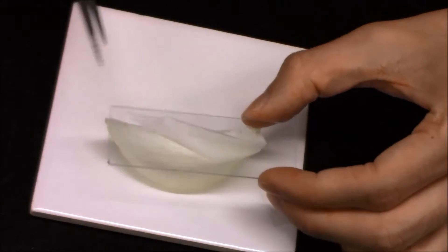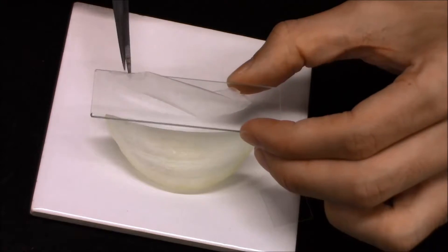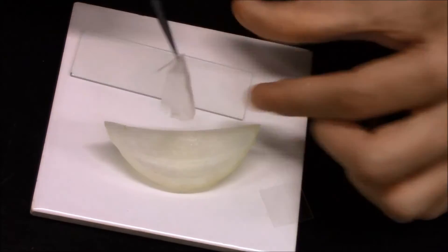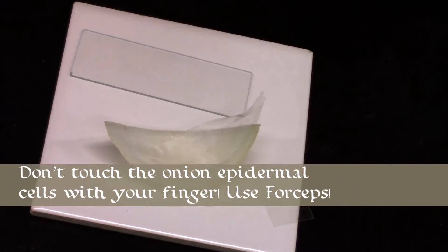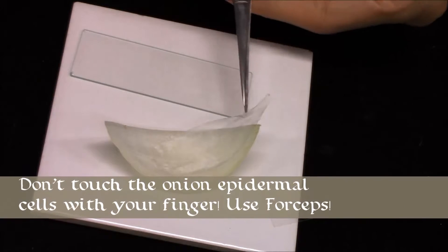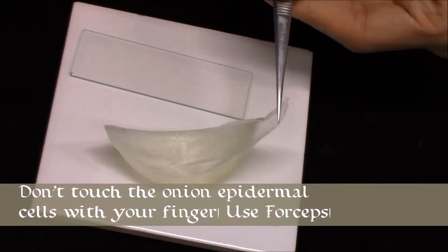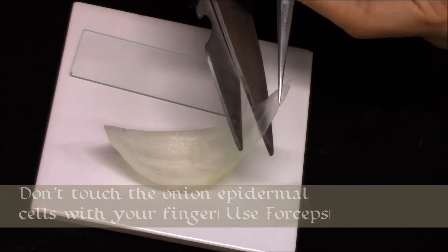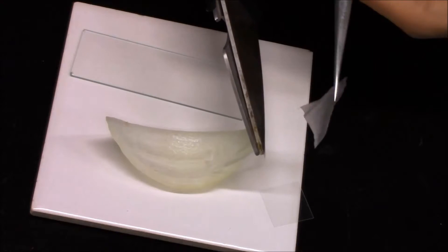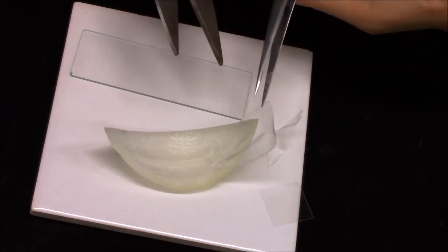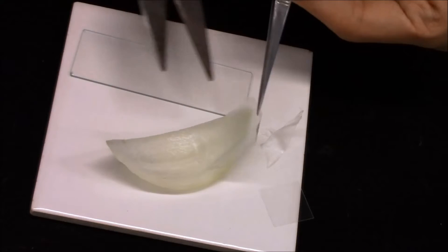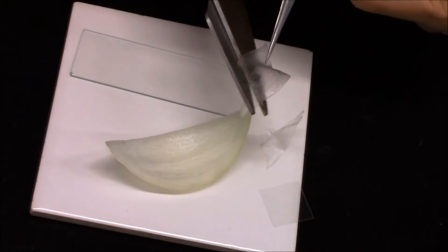So after tearing the thin layer of the onion epidermal cell, you see that when you put it on the microscopic slide, it's very large. So what you need to do is to cut it into smaller pieces, and try to hold it by using the forceps and cut it, and make it much smaller, and cut it in half.